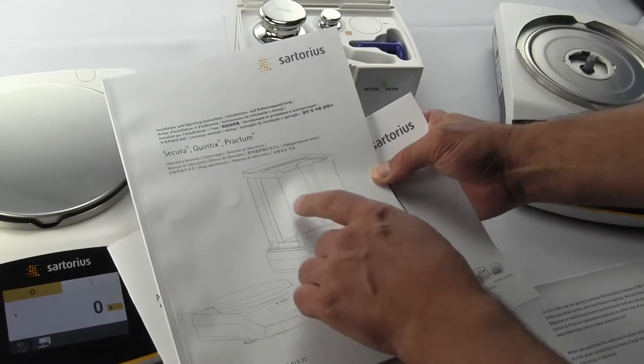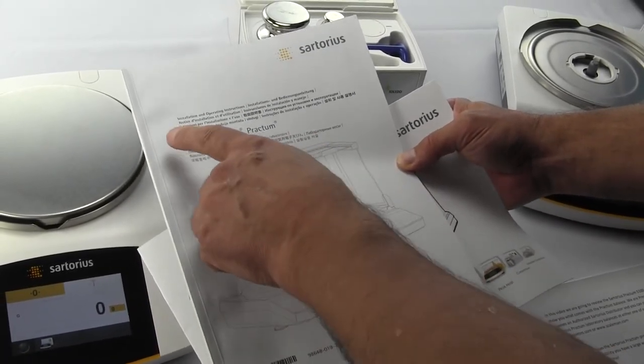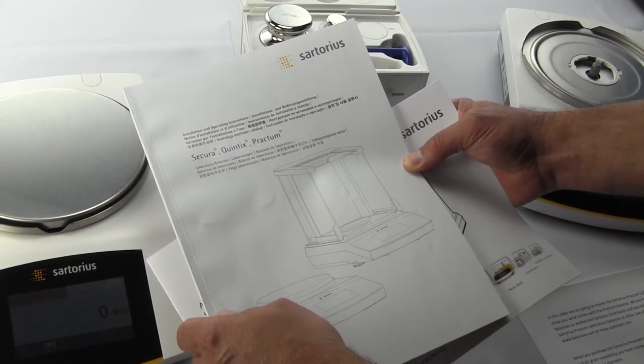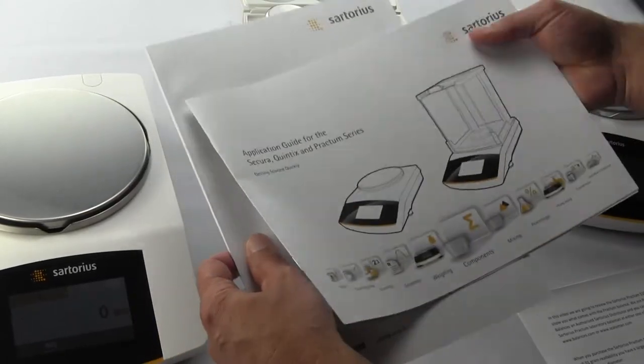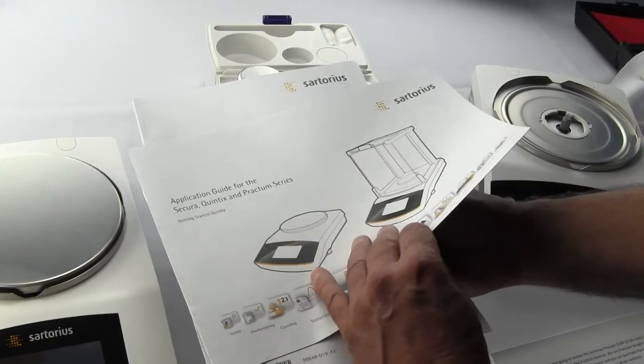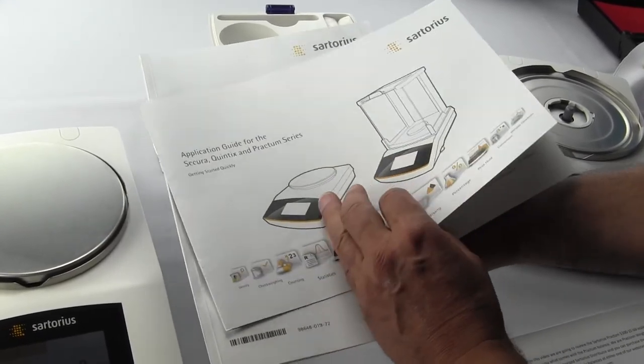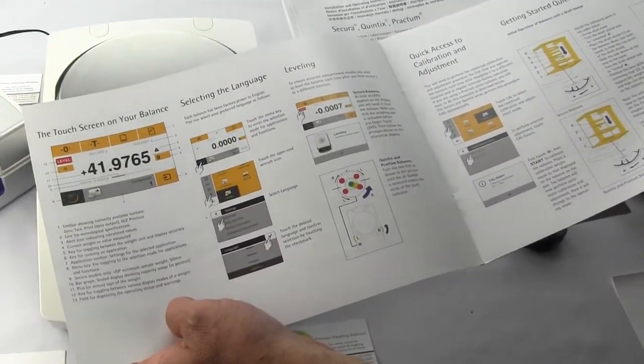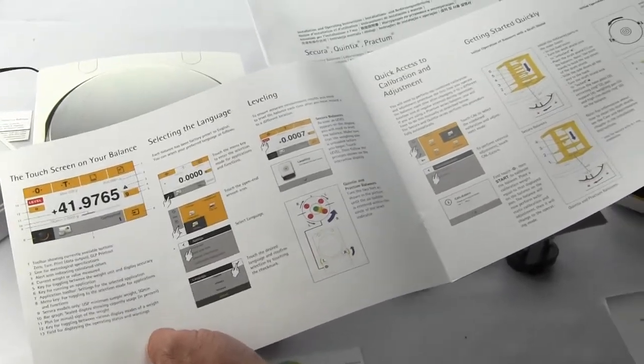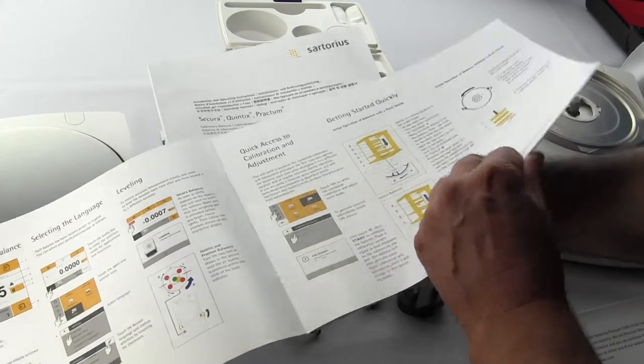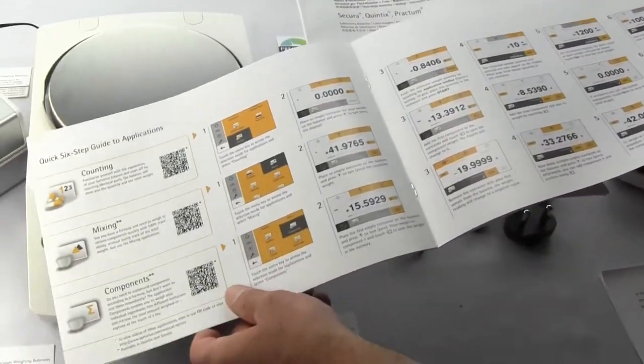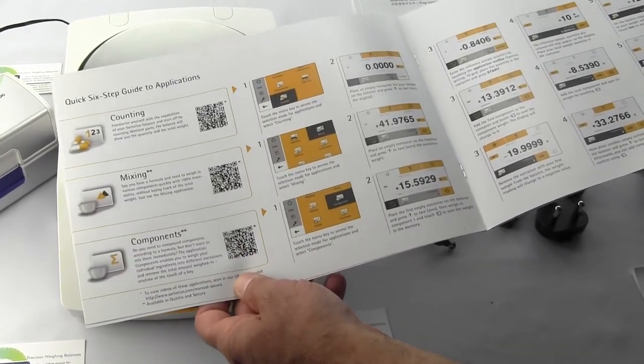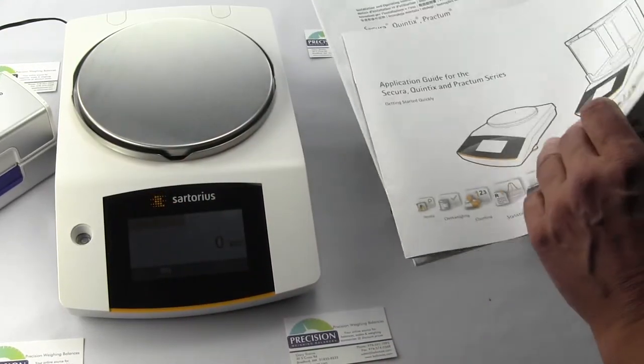You also receive with the Practum, and this would be the same for the Secura and Quintet series, this installation and operations instruction guide and the application guide for the Quintet, Practum, and Secura series. It's a nice colored brochure that easily explains the whole balance and operation. There are even QR codes you can scan with your phone that bring you directly to Sartorius' website to learn additional information.